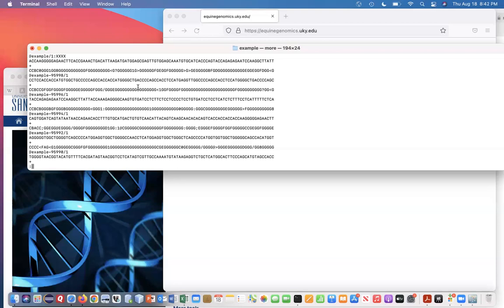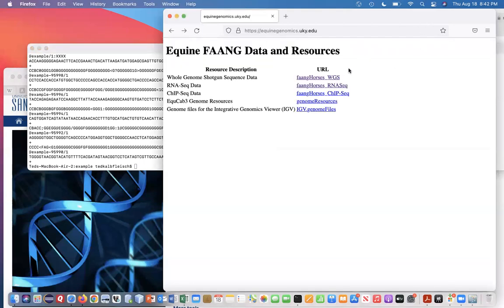By making mapped data sets available to them, we can really improve the utility of the data. So how is it that we would use these data sets?